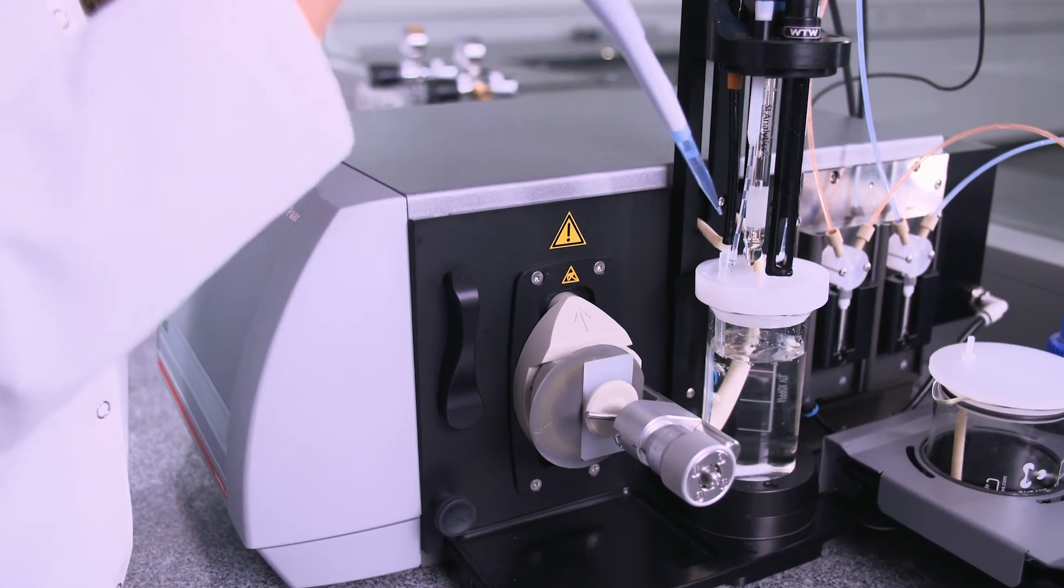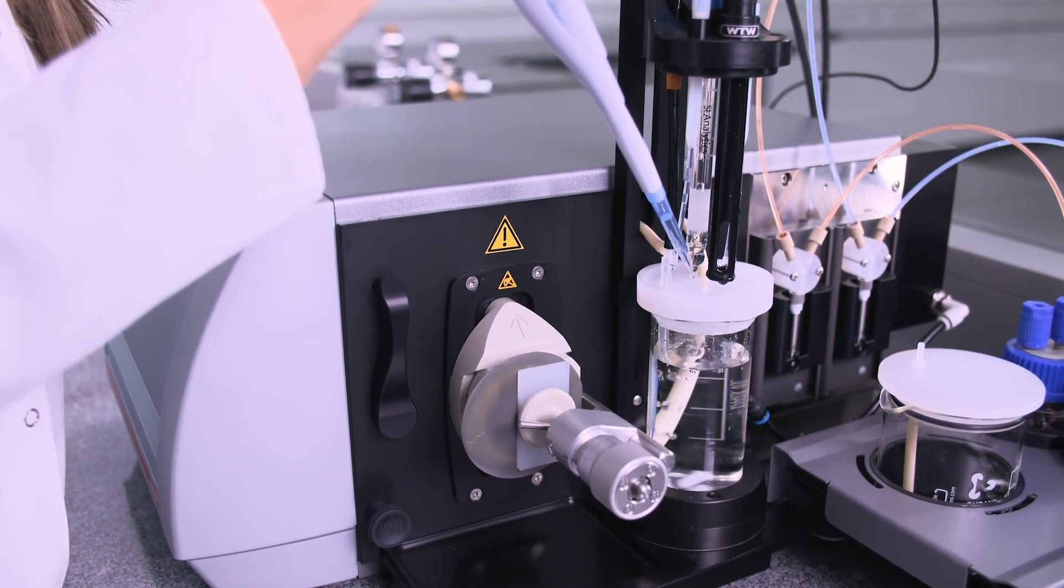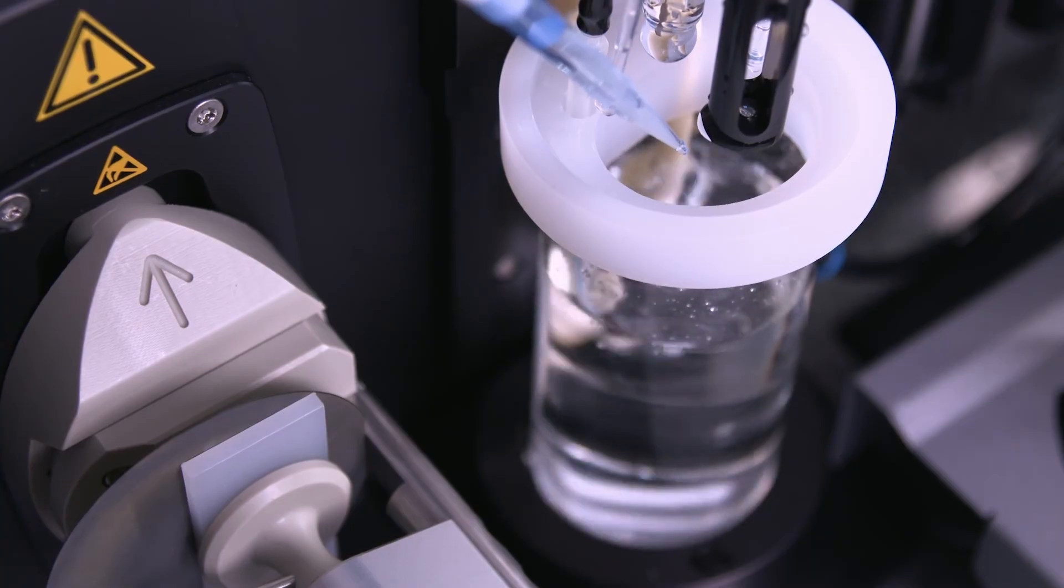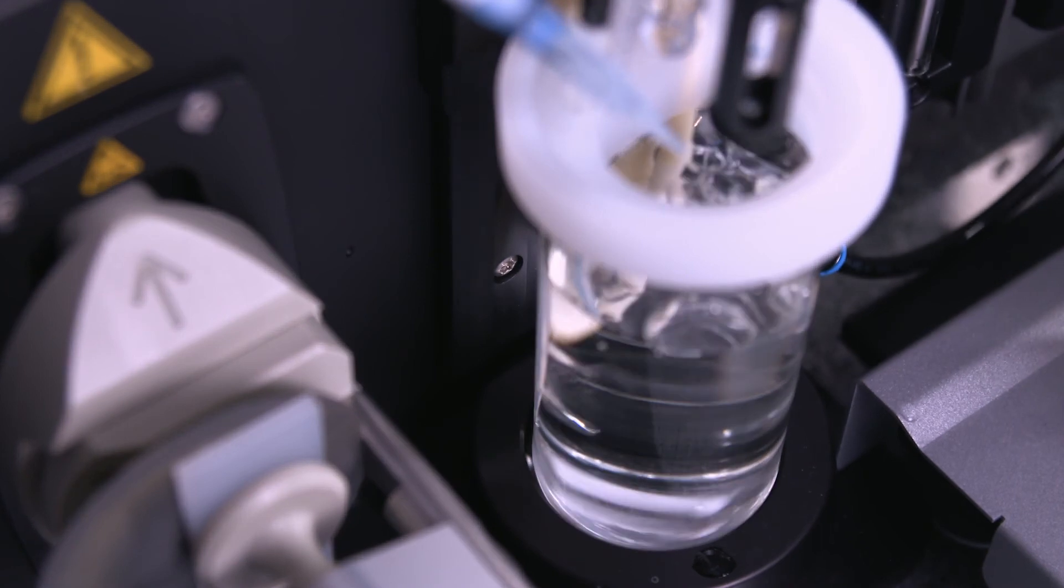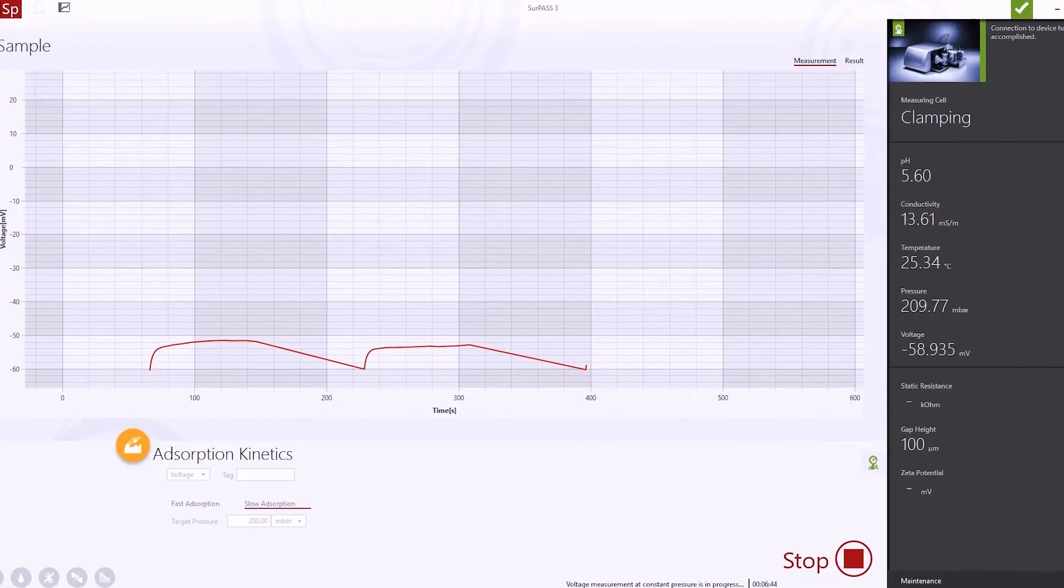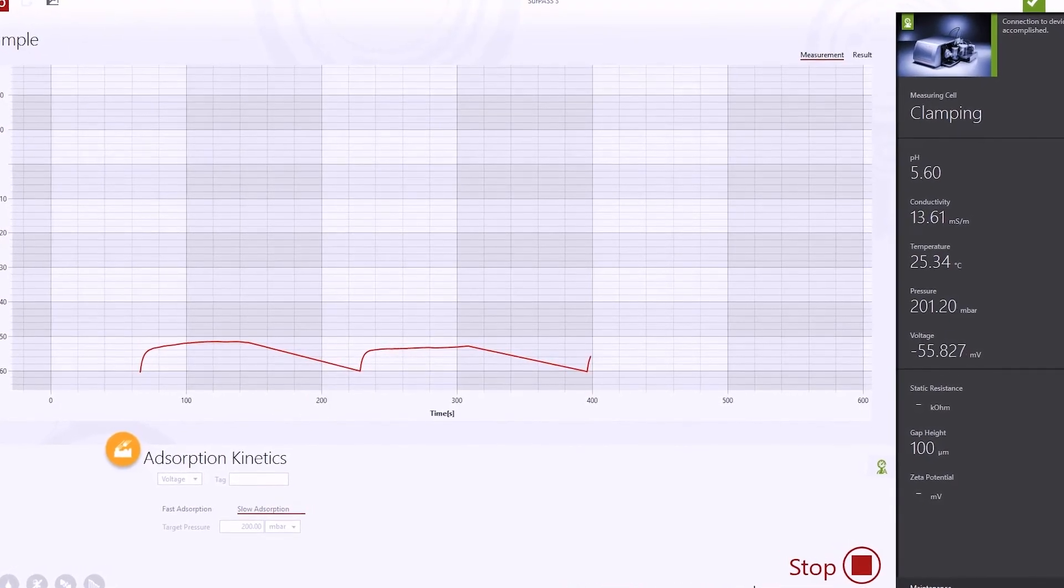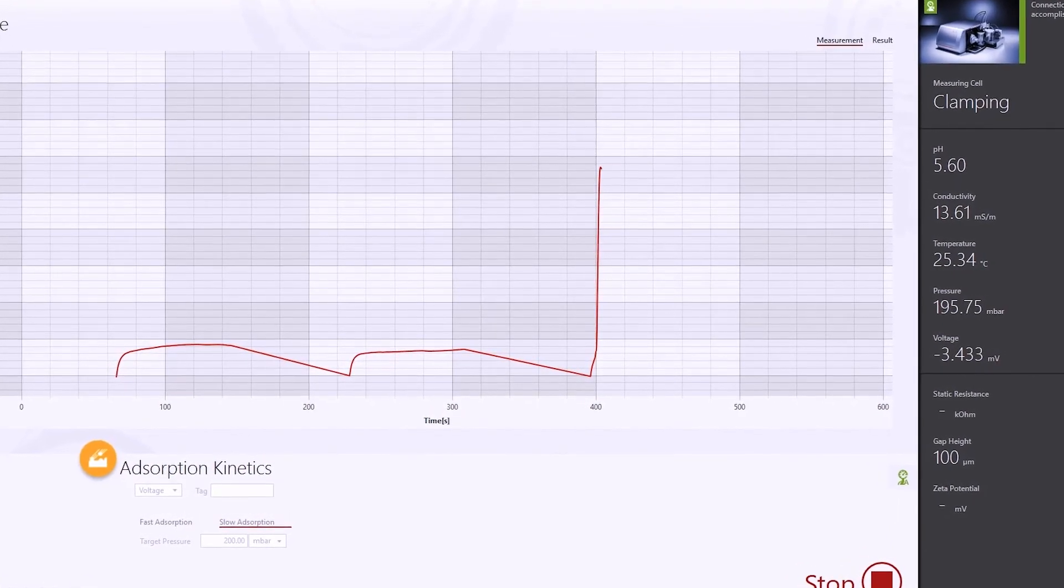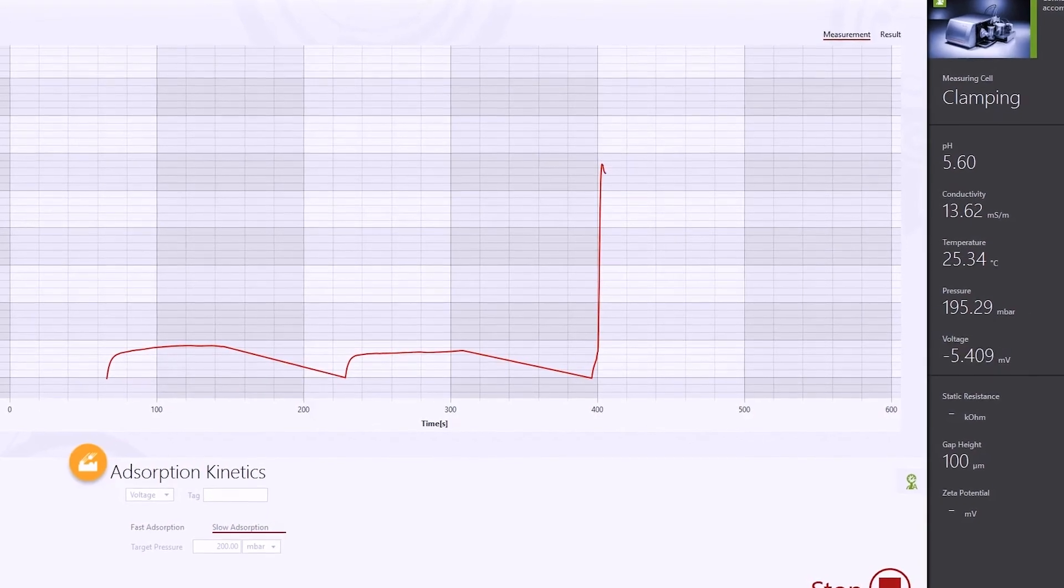After recording a baseline using pure electrolyte solution, small quantities of the adsorbent are added to the electrolyte solution. Throughout the whole measurement, N2 purges the electrolyte solution to avoid an adverse effect of dissolved CO2 and to ensure reliable results.